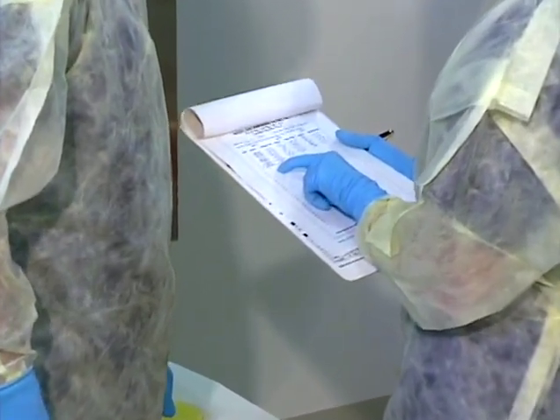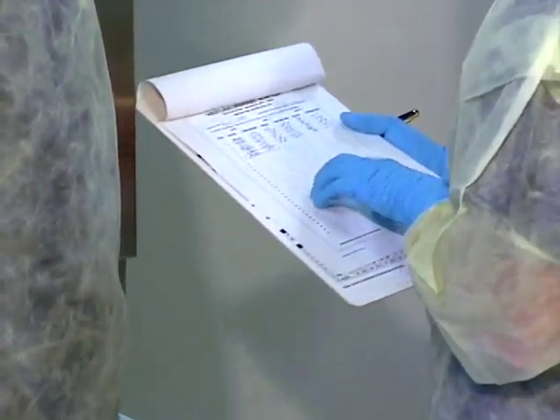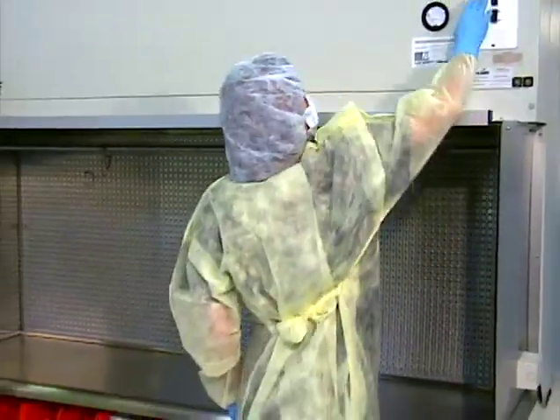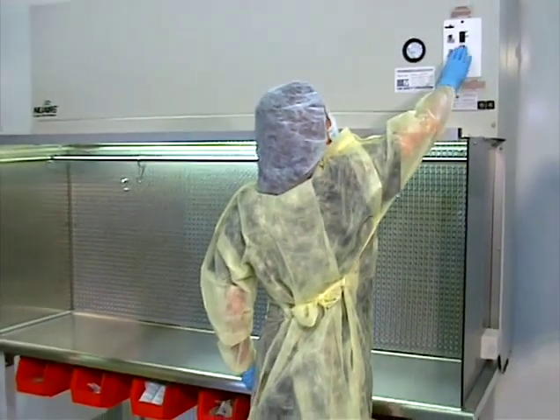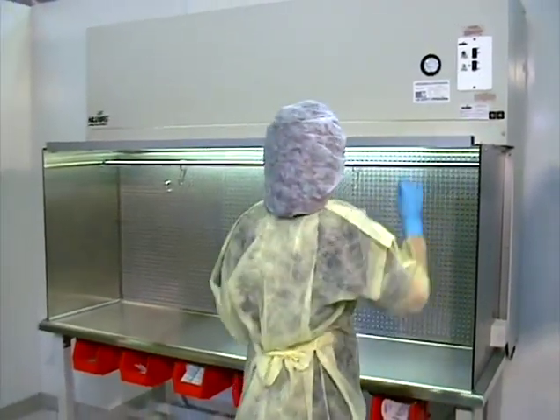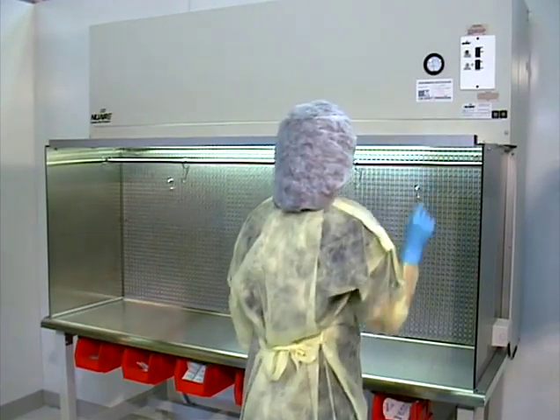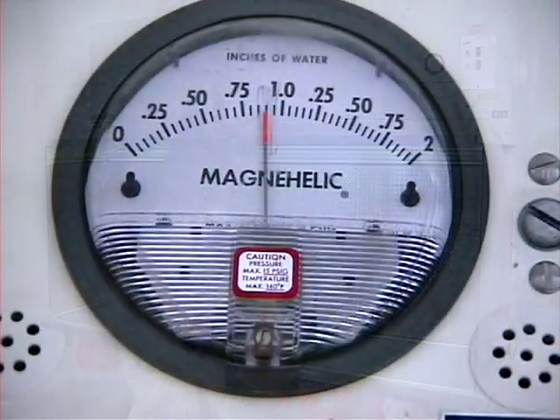Proper operation of the hood should now be verified. If the hoods have not been operating, they should be turned on and allowed to run for at least 20 minutes, allowing them to stabilize. The performance certification of the hood should now be verified by checking that a sticker referencing a test report and expiration date for the current period is affixed to the service panel.